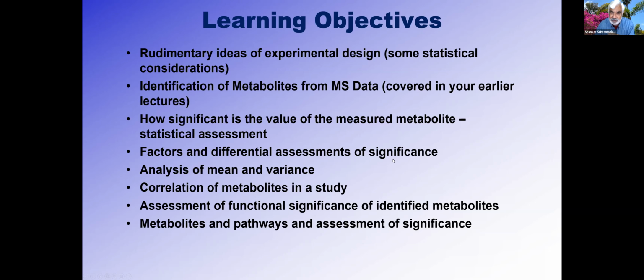Factors and differential assessments of significance. You always want to compare two conditions, a tissue or a cell treated with a drug and without a drug, or a human study between two genders or two genetic backgrounds, etc. So I'll tell you how to look at differential assessment of significance. We'll briefly talk about analysis of mean and variance.